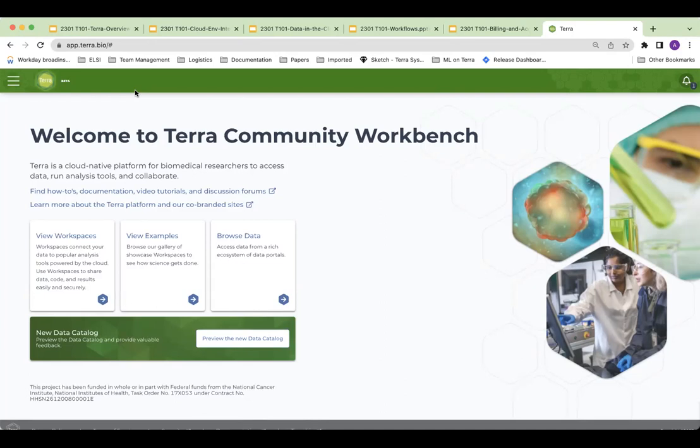I think that's one way to look at it. Depending on the type of research you do, maybe you want to visualize everything in aggregate. But yes, the interactive analysis, the visualization, is what happens downstream. So you have a bunch of data, you brought it in either on your own or from some sort of public or access controlled data set, you run some workflows against it, and then you do something like opening a notebook, which is what we're going to do today. Thank you.